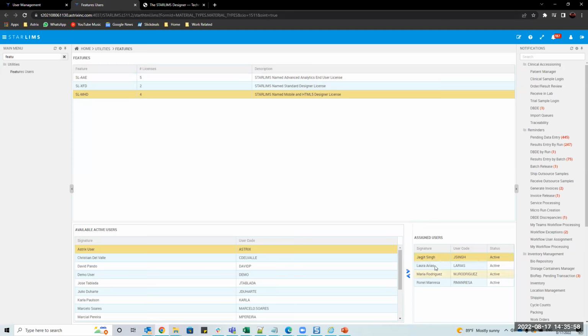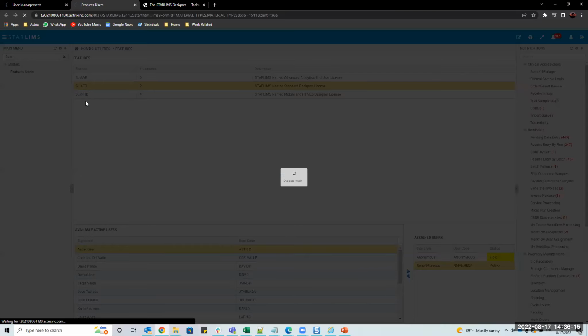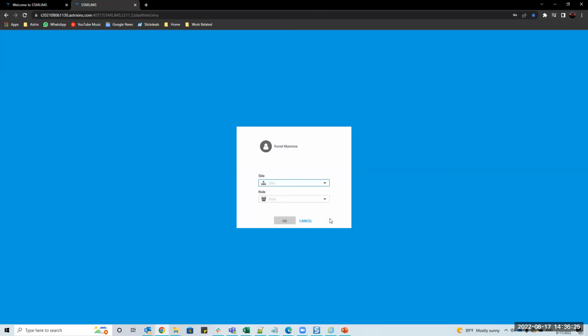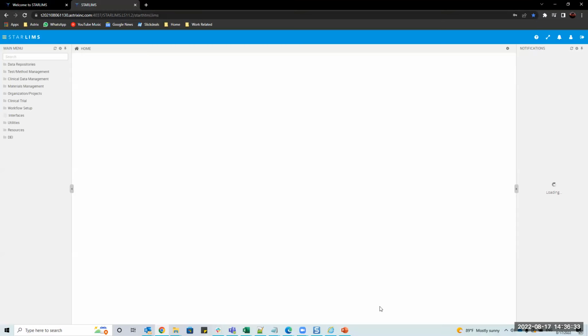In this system it's Jajit, Laura, Maria, and myself. That's the partition. For XFD, I'm not expecting you to look at it, so it's just me, but that's where you go if you need it. Then there's something like AA, which is less useful and we're not going to look at it right now, so I wouldn't worry too much about it. So yes, Jose, it's confusing, but don't worry too much about it.